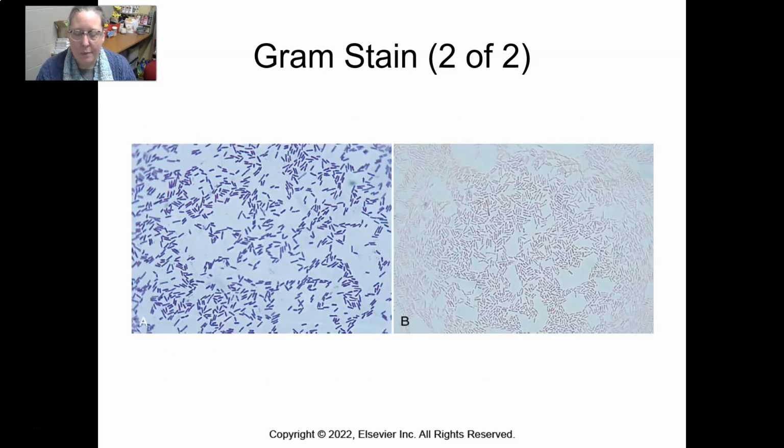And so here's an example of gram positive rods on this side here, nice pretty purple color. Sometimes if the stain's really deep, it could even appear like they're almost black, but this is purple. This is pink or reddish pink, and this is a gram negative rod.